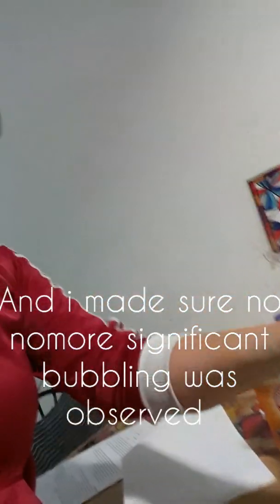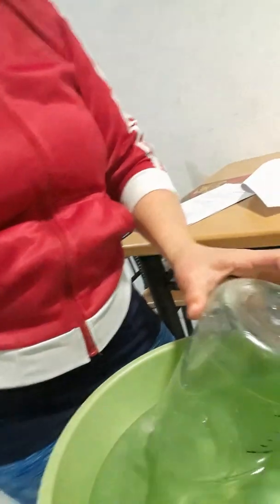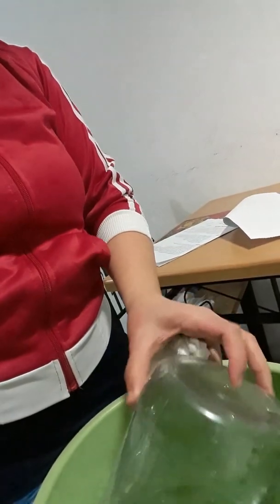And now I will put the clear jar and submerge it into the water.